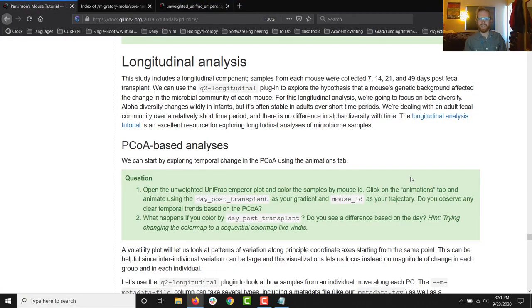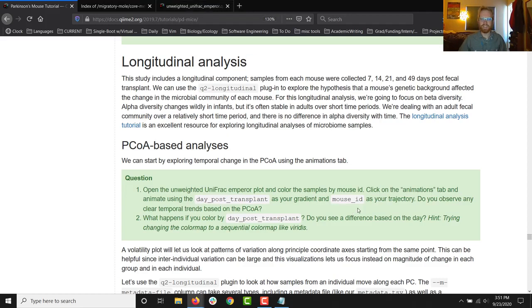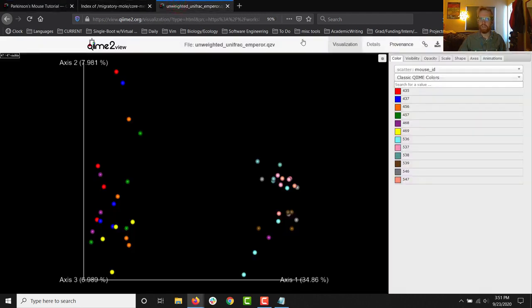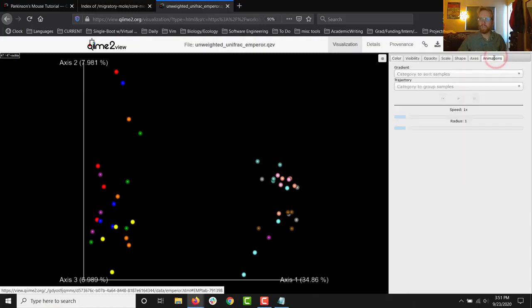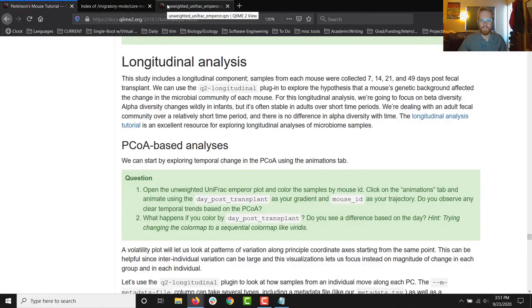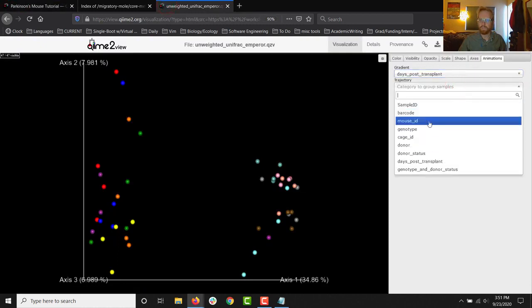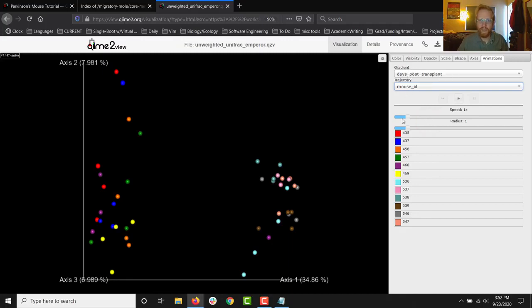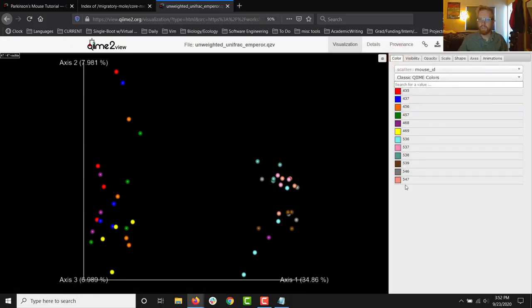Here we're going to do something really cool — we can animate these things. I've been working with emperor plots for six months before somebody told me I could do this. We're going to click on the animations tab and animate using day post-transplant as gradient and mouse ID as trajectory. So the animations tab is over here on the right. Days post-transplant is our gradient, and mouse ID is our trajectory. You'll notice the row of colors on mouse ID matches exactly the row from the original color plot.